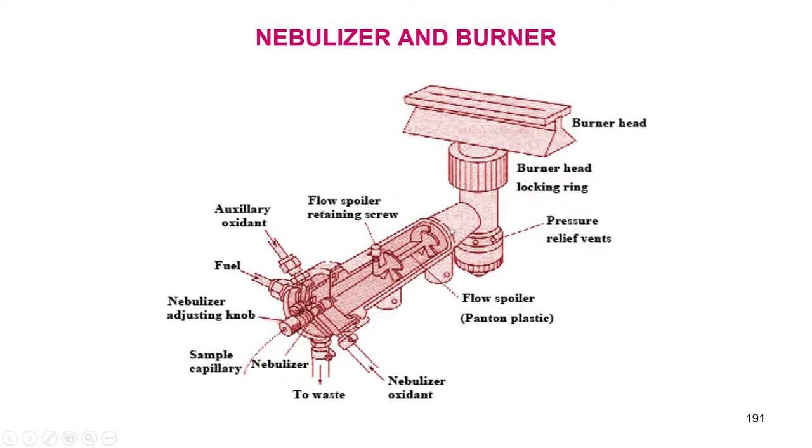So, we will continue our discussion on the nebulizer, but before I go on to this, I want you to take a look at the new slide which I am going to make for you. So, the actual layout of an atomic absorption spectrometer, for your convenience, I am going to write it here.